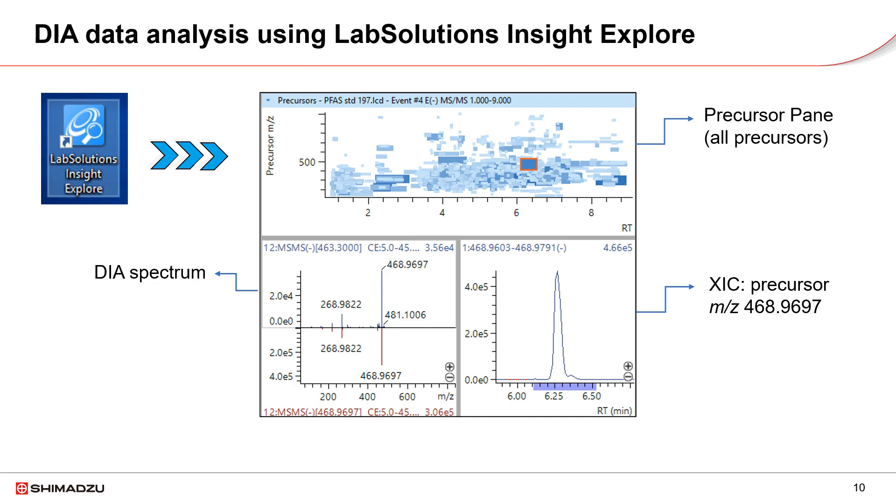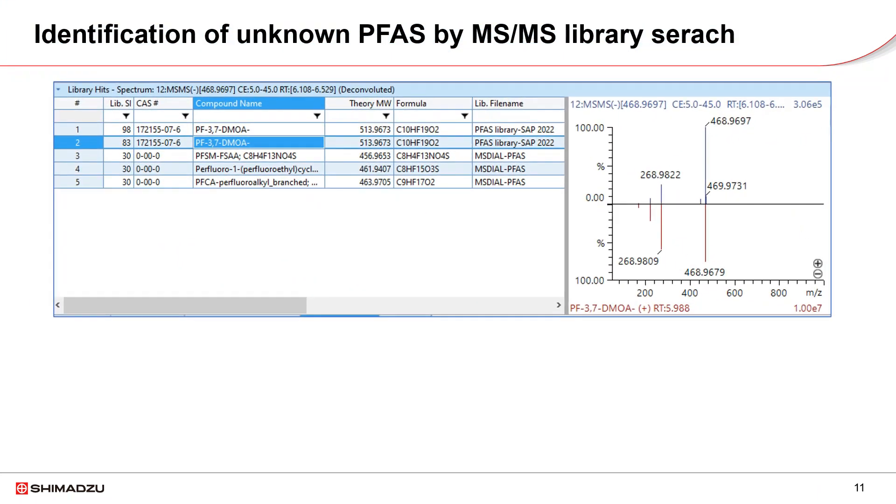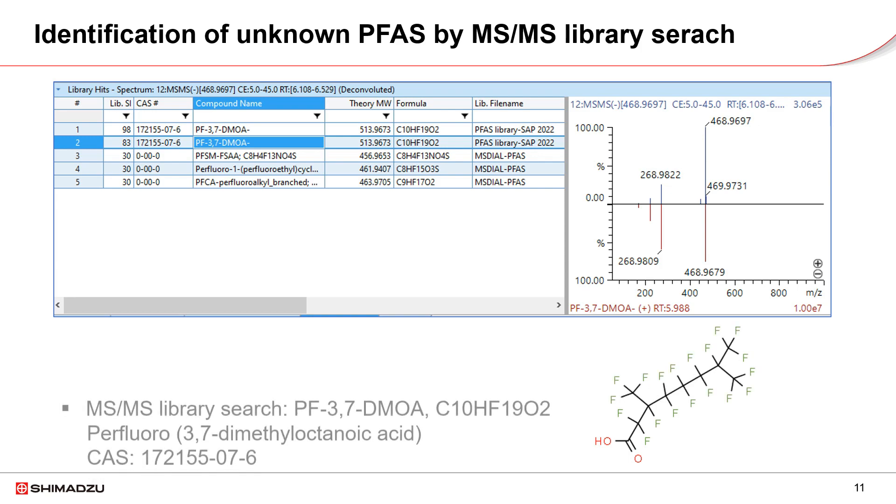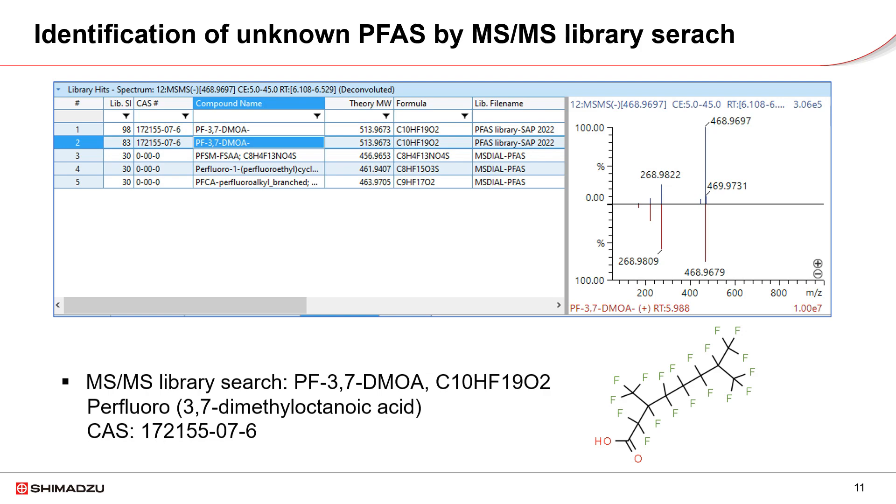Further identification of the compound can be carried out by MS-MS library search, formula predictor, database search and fragment annotation. Click on MS-Library search. The result shows that a PFAS, named as perfluoro-3,7-dimethyloctanoic acid is identified with high similarity index. The MS-MS library used are in-house high-resolution PFAS library and MS-Dial PFAS library.